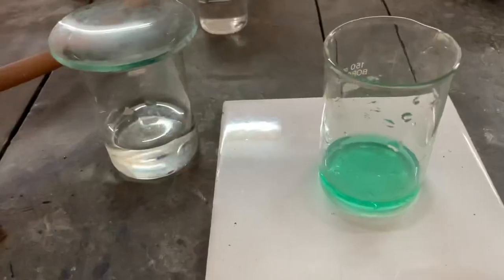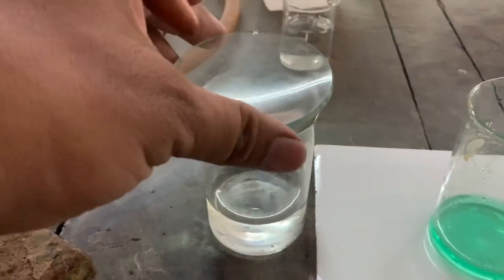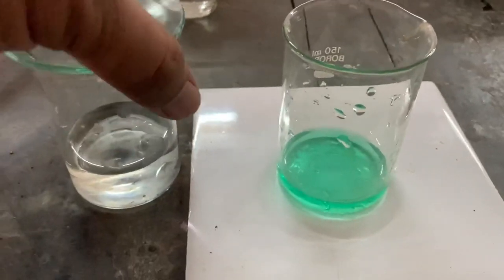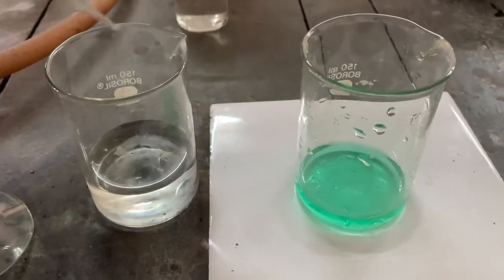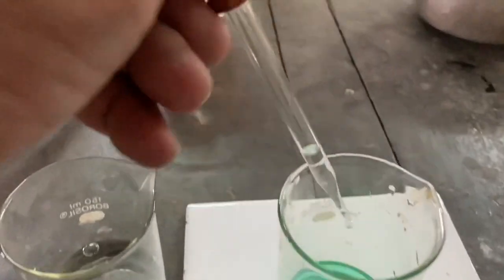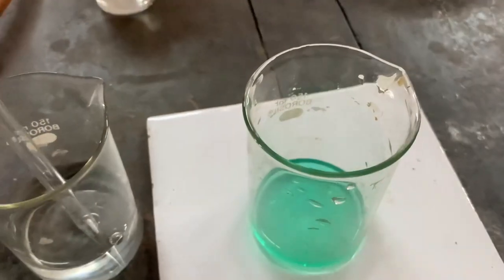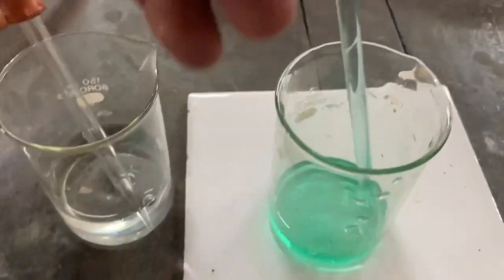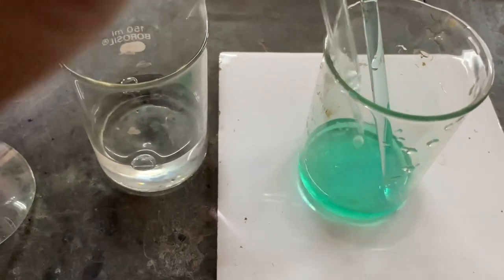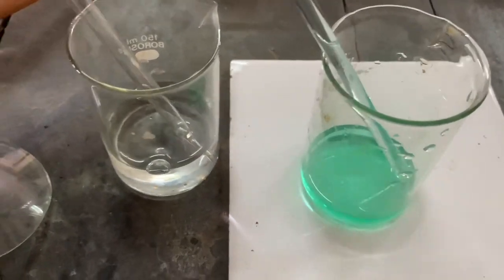Now, this is ammonia solution. For safety I kept a watch glass on it, and this is our filtered nickel sulfate solution. Now into it we'll add ammonia solution dropwise. And we'll stir it. We'll add ammonia solution till the smell of ammonia comes out of this beaker.